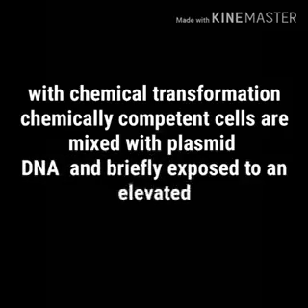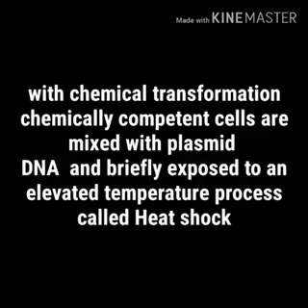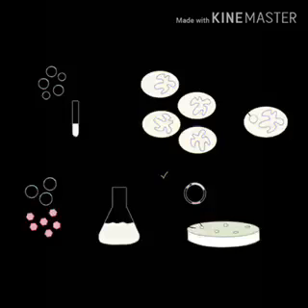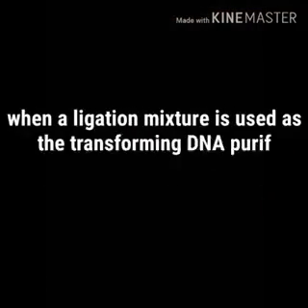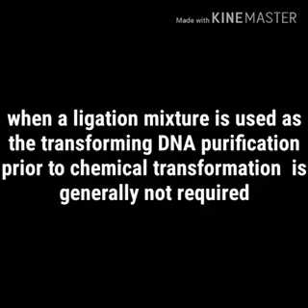With chemical transformation, chemically competent cells are mixed with plasmid DNA and briefly exposed to an elevated temperature, a process known as heat shock. First, cells are incubated with DNA on ice for 5 to 30 minutes in a polypropylene tube. For successful chemical transformation, 50 to 100 µl of competent cells and 1 to 10 µl of DNA are recommended. When a ligation mixture is used as a transforming DNA, purification prior to chemical transformation is generally not required.